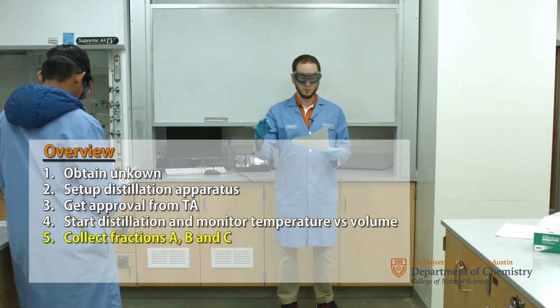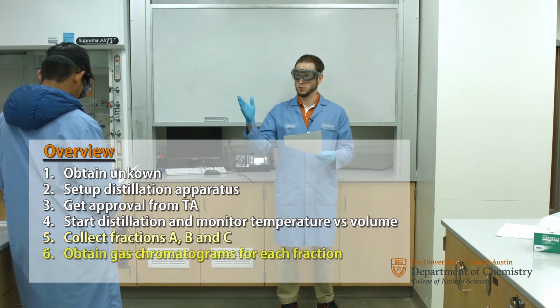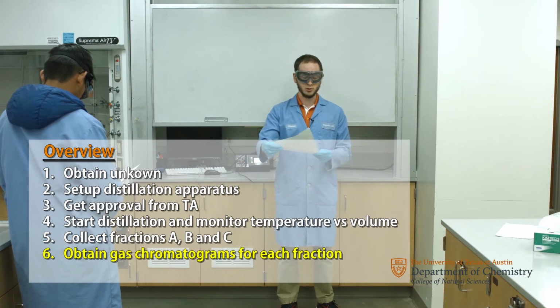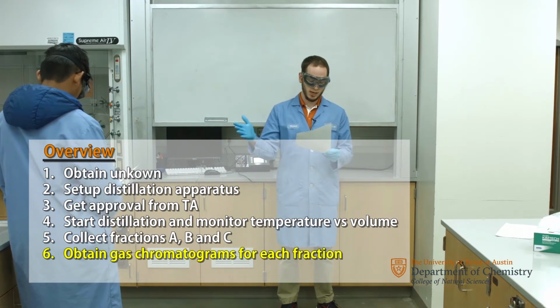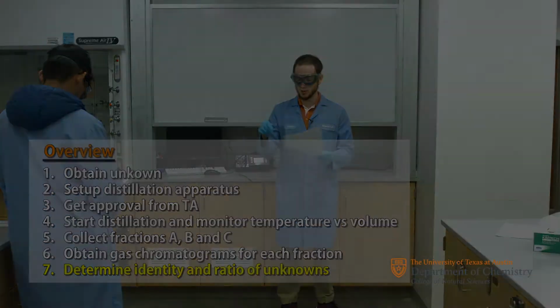You're going to be collecting 3 fractions, A, B, and C. Once they're collected, you're going to go ahead and get the gas chromatograms for each fraction. You'll use the retention times to determine the identities of each of the compounds, and you'll use the peak integrations to determine the composition.